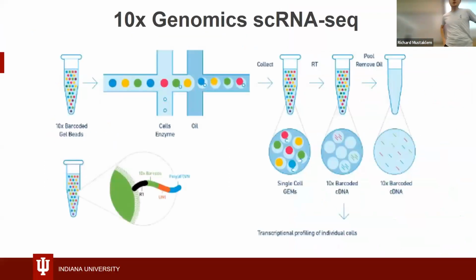Okay, so one of the biggest companies for single cell work is 10x Genomics. The reason is they basically have a monopoly on the industry, so they produce most of the data. They produce machines that scientists will pay for, and they're very expensive. The reason I chose them today is because you'll probably be working with some of their data in the future, and it's important to know how they even get the data. So I'm going to walk you through this step by step. I have it written down here because I don't want to mispronounce anything.